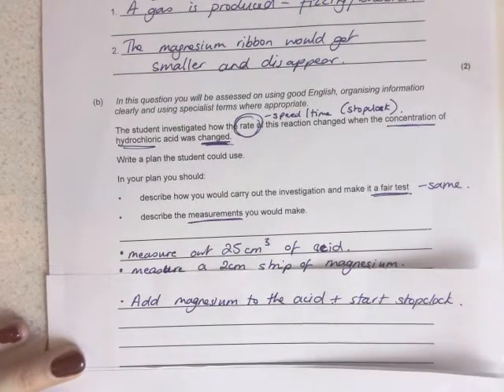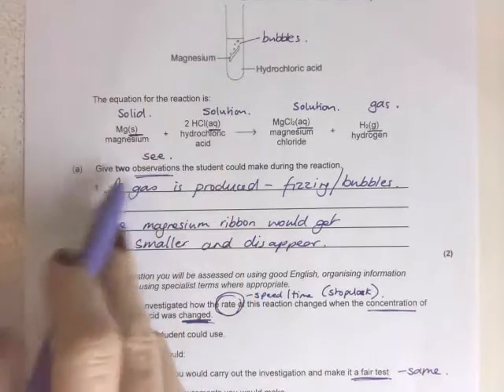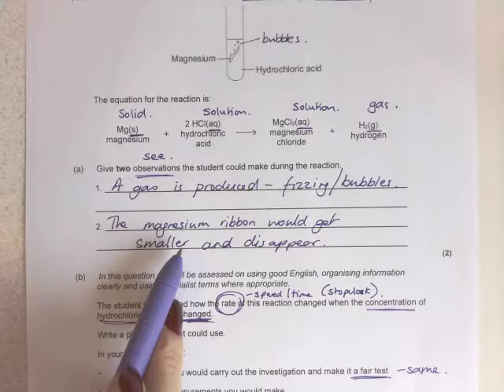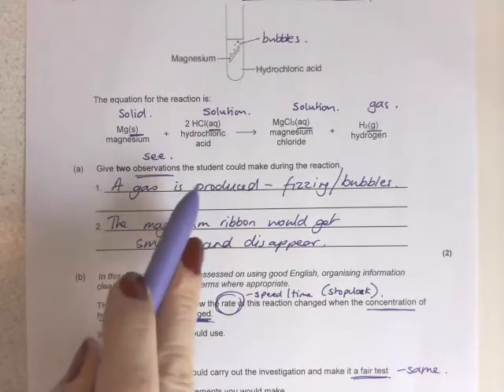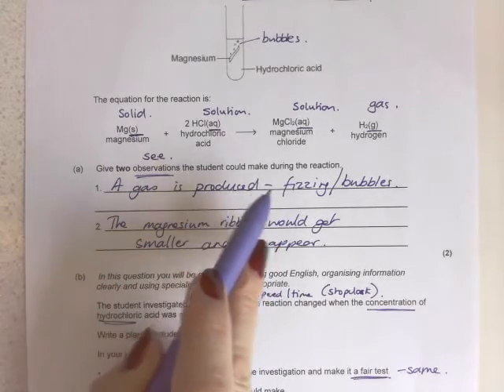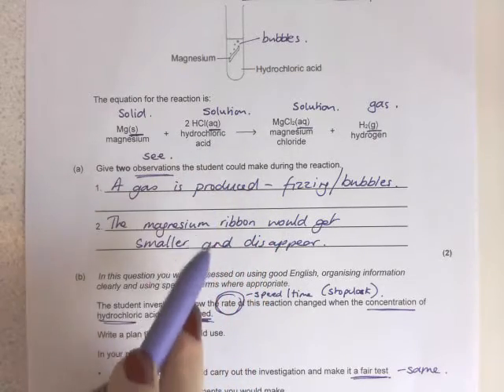Now, I've got two options here in terms of what I measure. I could either measure the number of bubbles, or I could measure the time it takes for the magnesium to disappear. I've got two options because these are my observations. I could measure the number of bubbles in a minute or in half a minute, that's one way I could do it.